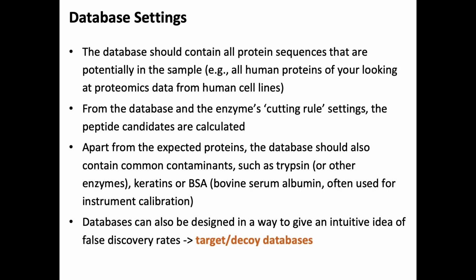When we do a database search, then this database should contain all the protein sequences that are potentially in the sample, but it shouldn't contain anything else. We will see that there might be an exception to that.